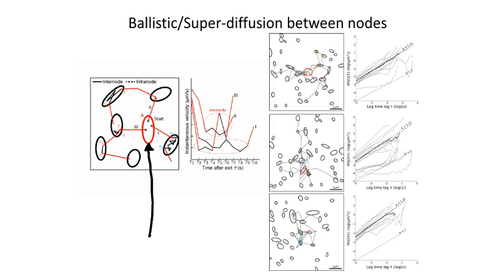So basically the trajectory starts inside A, and here this is one example. One trajectory went to the right, another went up, another one went to the left, and we could follow their paths as a function of time.